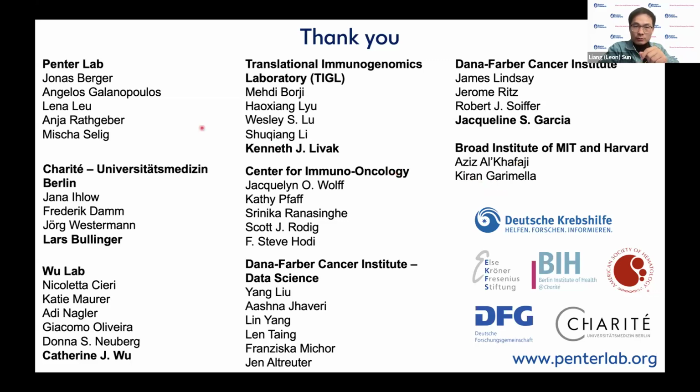Yeah, absolutely. One aspect I'm thinking about is how to scale this up. In this work, I've looked at only 3, 4, 5 mutations per case. I'm thinking about how to increase the throughput to be able to look at 50 mutations in a leukemia. This requires a bit of change in workflow, so that's something I'm working on.